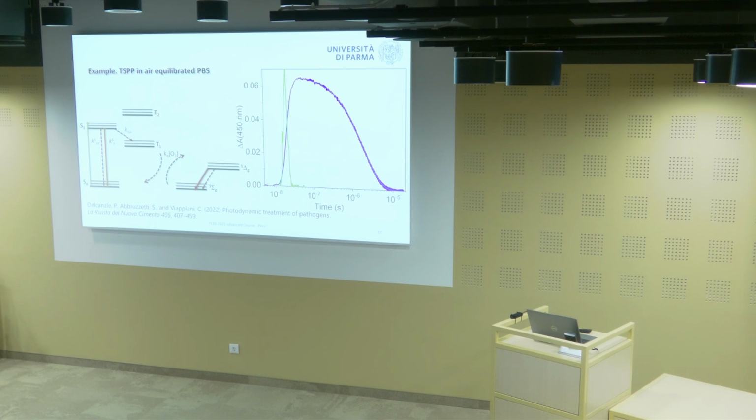Here is the overall time course on a log time scale. You are aware that in biology, signals are extended in time. This is one example, although the biology is very simple. It's a photosensitizer. But you can see that there are kinetics here in the long nanoseconds, well, not so long nanoseconds, in the tens of nanoseconds, and it keeps going here in the microseconds. So it's 4 orders of magnitude.